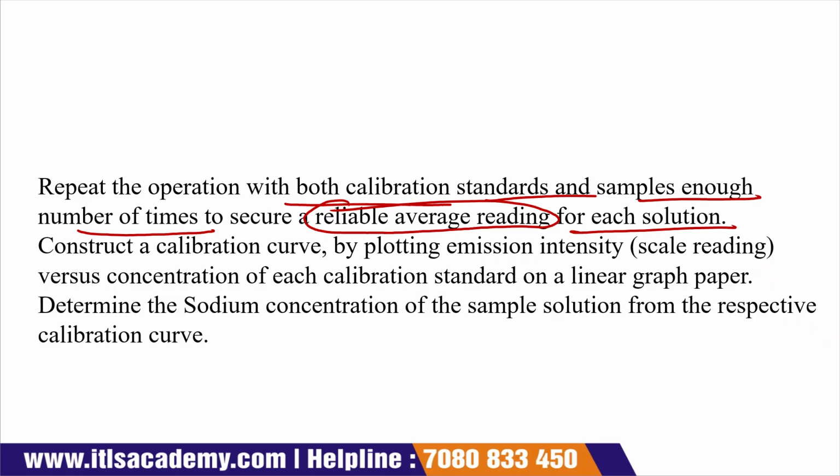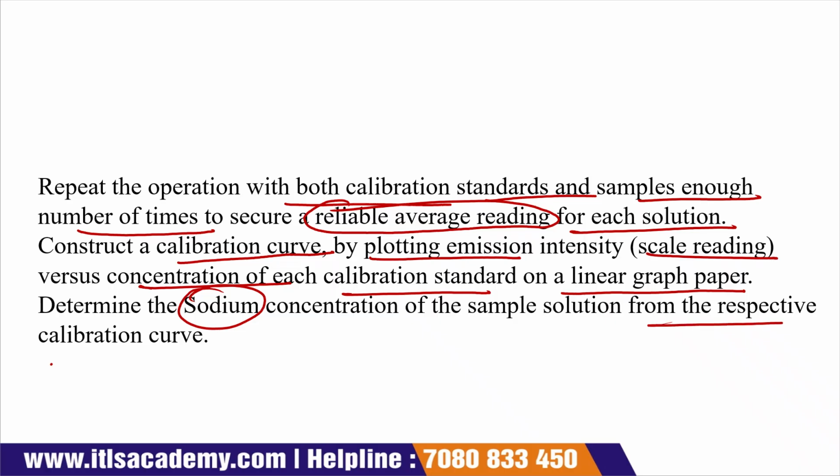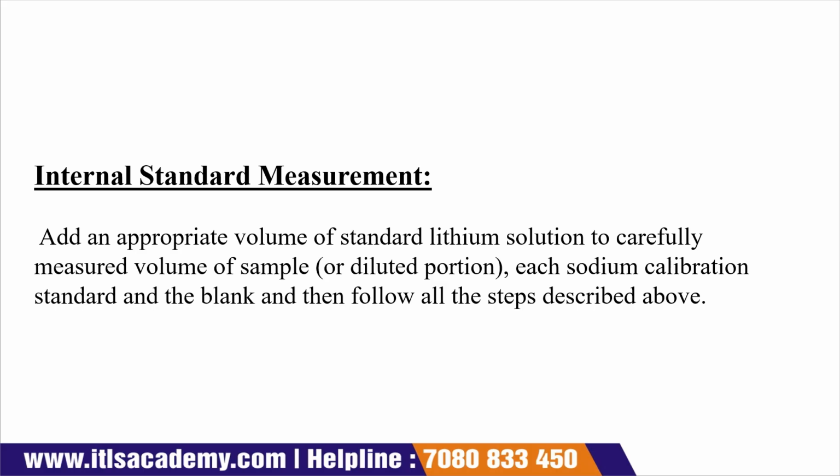Then we construct a calibration curve by plotting our emission intensity scale reading versus concentration of each calibration standard on linear graph paper. After that, we determine the concentration of sodium in the sample solution from the respective calibration curve. Then internal standard measurement.